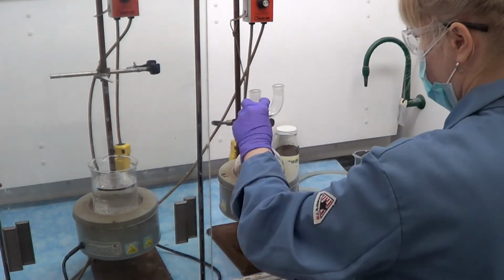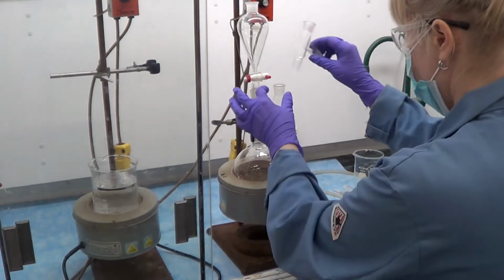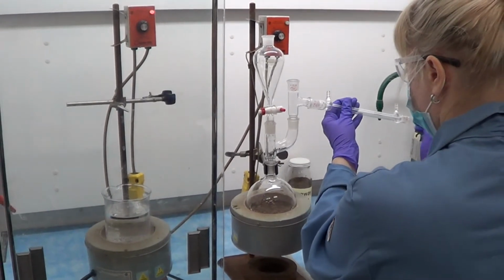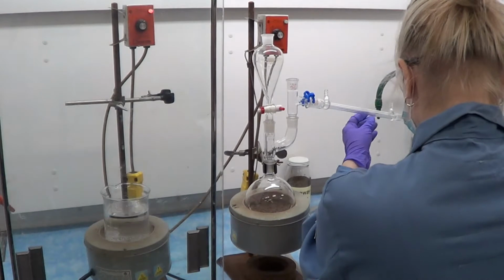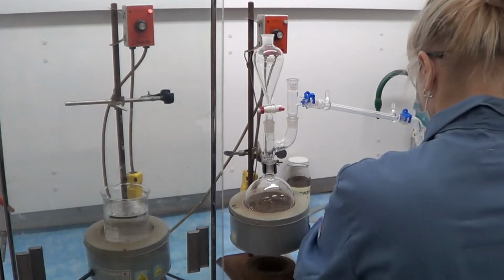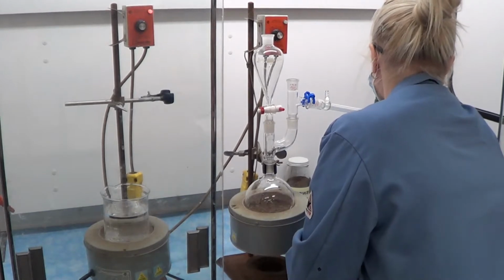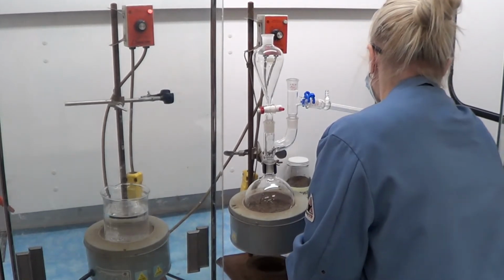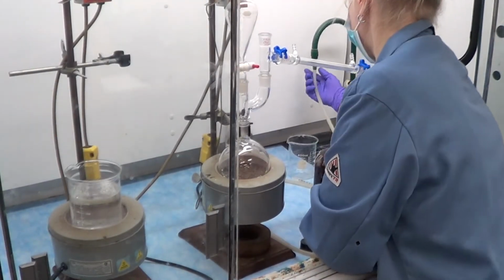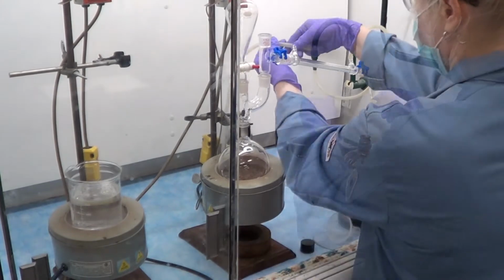A Claisen adapter is then attached to the round bottom flask and a separatory funnel to the top of it, so that it directly drains into the flask. The still head, West condenser, and vacuum adapter are then attached with blue Keck clips to hold them together. The water hose is then attached so that the water in tube is going towards the bottom opening towards the vacuum adapter, and the other hose is emptying into the drain.